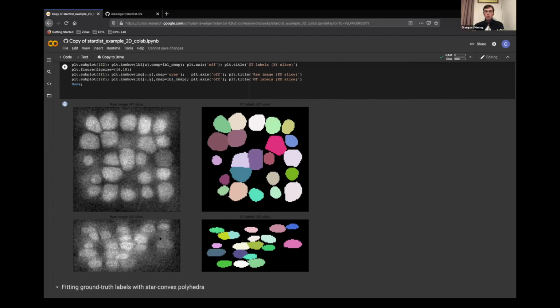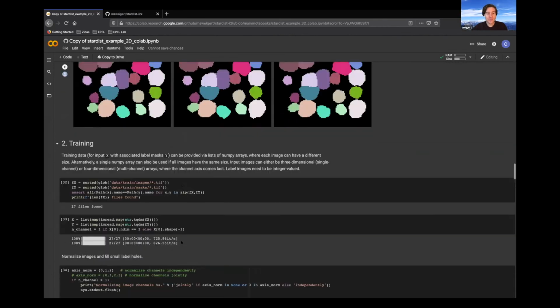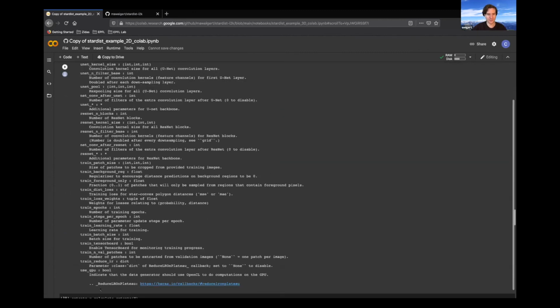Okay. So if the anisotropy is big enough, then we can use the... Exactly. So actually what it does is if the anisotropy is larger than a certain amount, so if they're squashed along the Z dimension, then you should make your prediction finely sampled to not miss one of the Z planes that are the important ones. But if they're actually quite spherical, you can subsample faster, right? So you can subsample more. And that's automatically calculated, but it's just for context, that's what's happening under the hood.